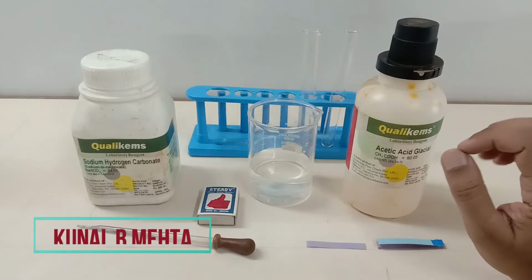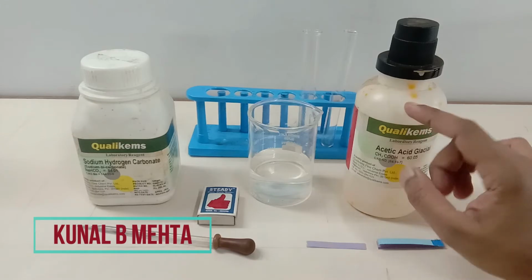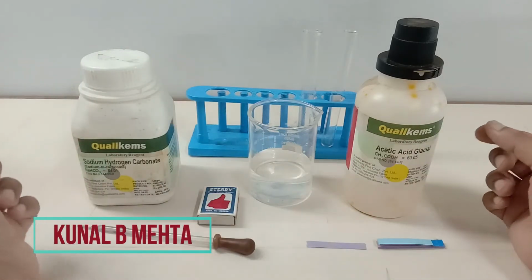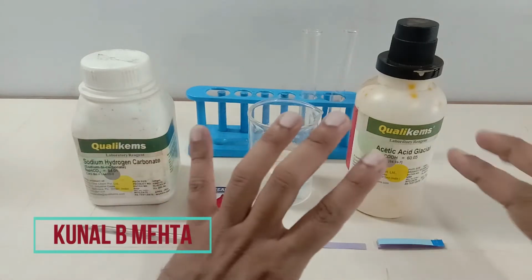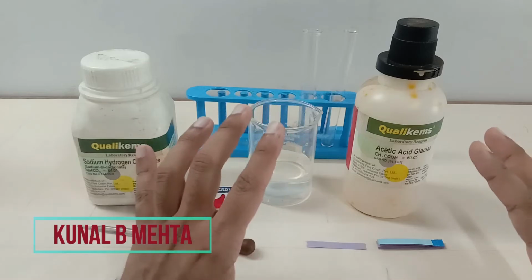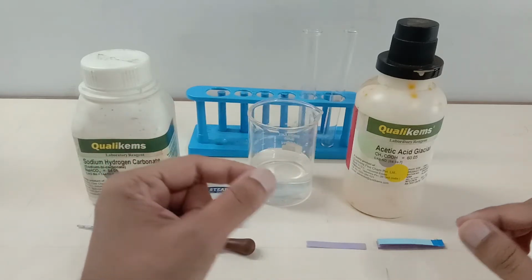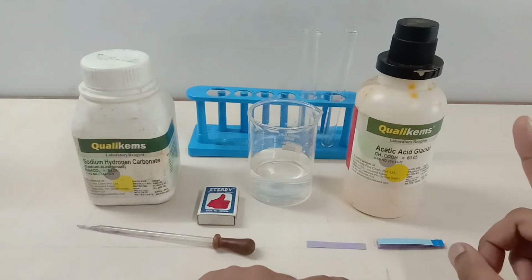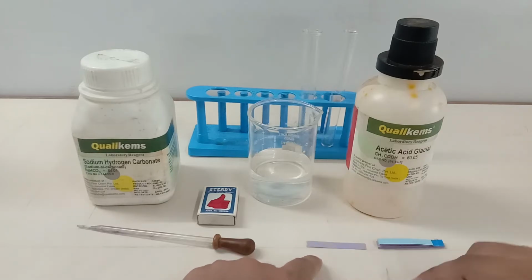So if you have not experienced the smell of this directly, if you just open up a vinegar bottle, which is mostly available in the kitchen, you can feel the pungent smell of the acetic acid. So we are going to demonstrate the following properties, guys. The first is the smell, and it is similar to the pungent smell of vinegar. The smell is pungent, a bit acidic, so sour in taste, but we should not taste it.